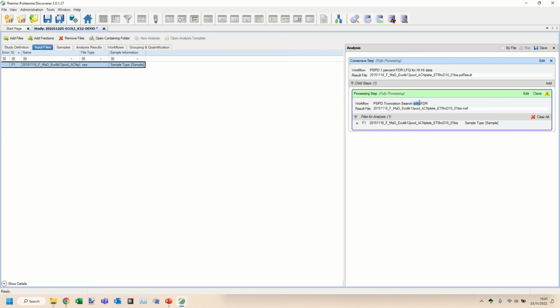Okay, great. It's not good. Oh, I have to copy it in here. I'm sorry, my bad. I copy it in there, and now my result file and my result file for consensus are both given this new name. So that's exactly what I want.